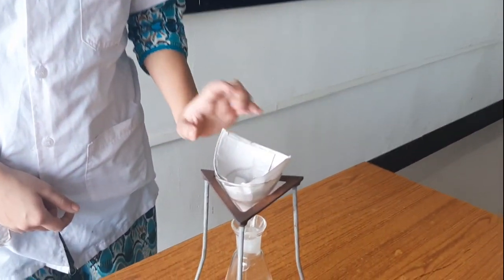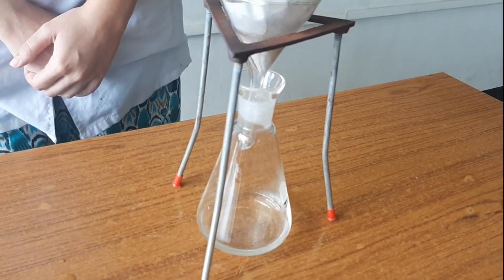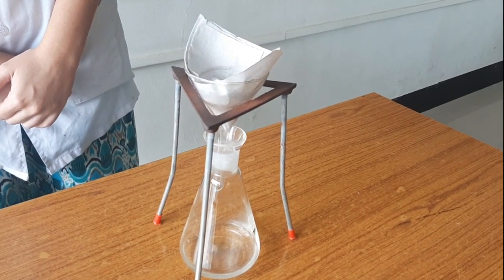Now if you observe this, we are at the end of the process of filtration. The time which was required for completion of this filtration was 4 minutes and 47 seconds.